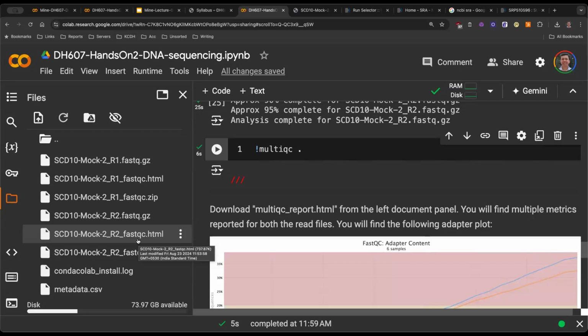But those reads are in sync. So you should still be able to, and actually that's why you're doing this cluster sampling. So all these reads are the same, right? This has been amplified sitting on that flow cell. That's why the bridge amplification is important, right?